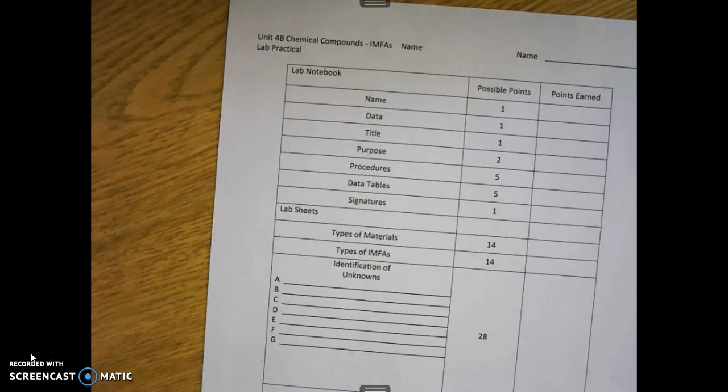So don't feel that you have to go through and do a lot of testing. If you don't need to do solubility testing, don't do it. If you can identify it in other ways, that's fine. So be smart about how you approach your procedures. And once you know the answer to something, walk away from it. Don't kill it.